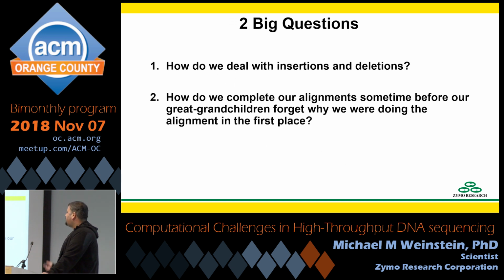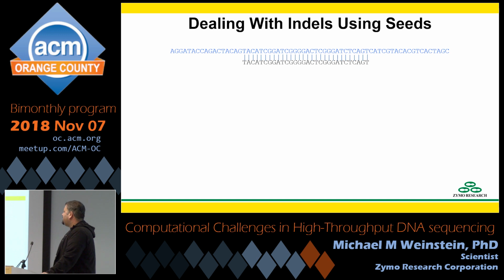So, 2 big questions. Number 1, how to deal with insertions and deletions. I'm going to bring that one up first because it's actually a pretty simple solution. Question number 2, how do we get things aligned before our grandkids try and figure out what we were doing in the first place? So dealing with indels turns out to be fairly simple. You use what's called seed-based alignment.